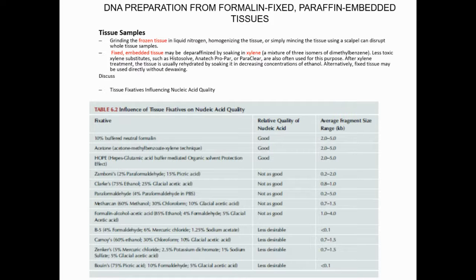And remember to make the FFPE block, the tissue is first immersed for 2 to 3 days in formalin, and then you have the fixation, and then the tissue block is dehydrated, okay, using the xylene and ethanol series and embedded in the paraffin wax. So these tissue blocks are therefore referred to as the FFPE sample.